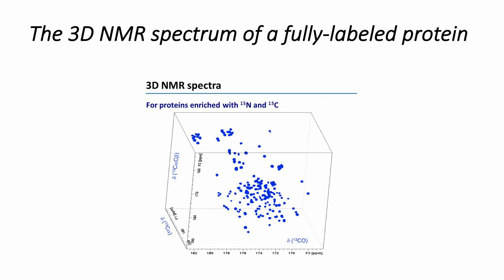This is just to show an example. You can do very complex experiments. This is a 3-dimensional spectrum of a protein, so this is something you would use in determining the protein structure. I've never acquired one of these, so all I can tell you is that you're looking at carbon resonances. What do we have up here for that? Okay, sorry. The protein was expressed by bacteria that were growing in food that was labeled with N15 and C13, so that there's incorporation of those nuclei in there, and it will give you signal, and you can use that.